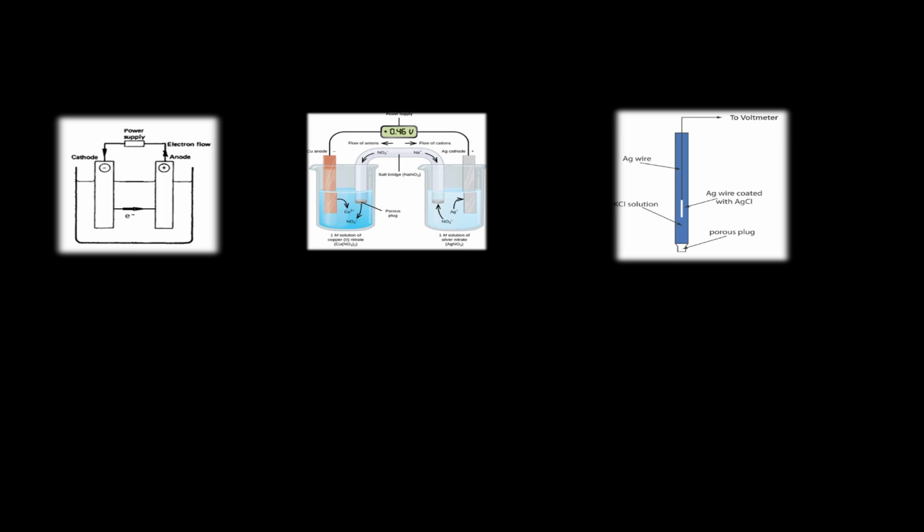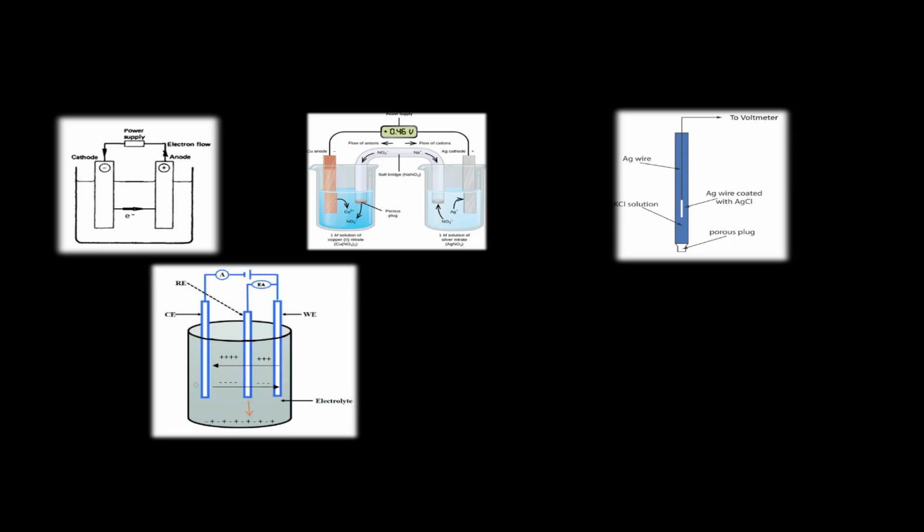It would also block, that is, prevent the reduction of any oxidation product that would lower the efficiency of a single cell. The power supply across the cathode and anode forces not only oxidation and reduction, it causes an accumulation of ions at each electrode. The salt bridge essentially neutralizes the charge buildup on the electrodes. As the electrical charges would have built up, opposing electric fields would also build up, eventually stopping the electron flow and freezing the ion migration. The salt bridge facilitates a stable flow of current through the system.